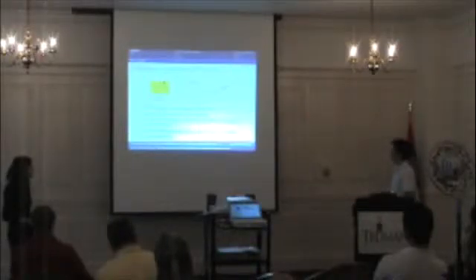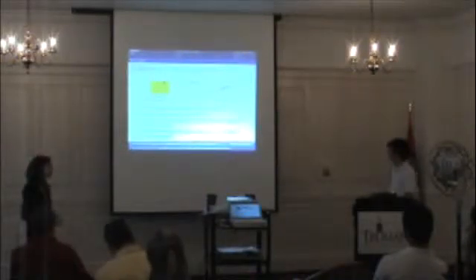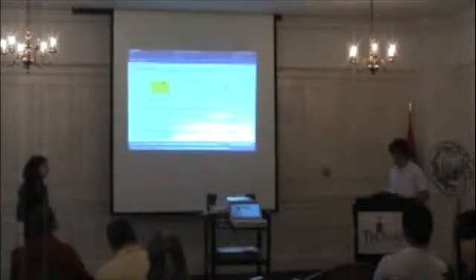Perhaps one of the most important aspects of C. elegans is that the eggshell of the embryos is transparent, and this really allows for our model to work for what we hope to do. We're able to see the shifts and orientations within the embryo, and that allows us to take video and capture these changes and model using image segmentation techniques that I'll talk about in a little bit. But if we didn't have this transparent eggshell, we wouldn't be able to do any of the work that we're doing without further applications.